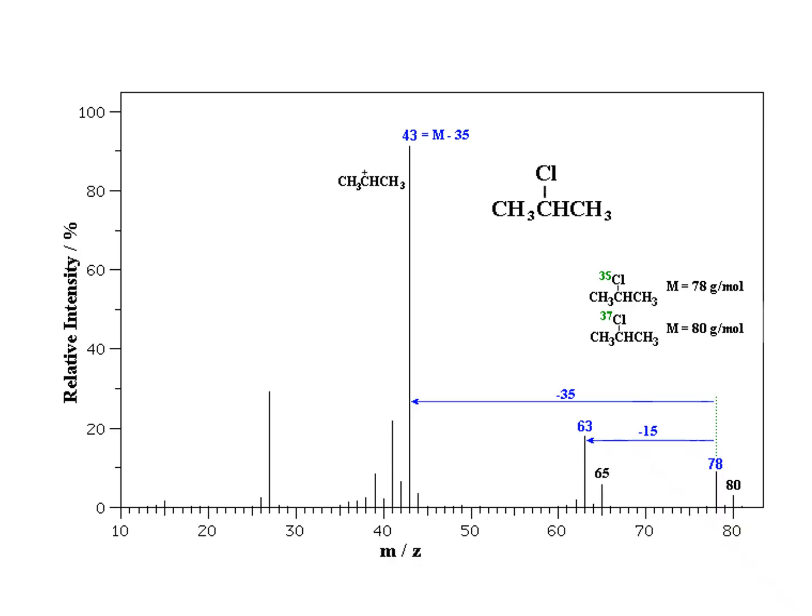If we look at this particular example, this again is another halogenoalkane, and we have chlorine 35 and chlorine 37. If we look at our molecular ion cluster on the right-hand side, we see that there's a 78 peak, a very small 79, an 80, and then an 81. So the 78 and the 80 again are the result of chlorine having a 35 and a 37. And we see the structure there with your chlorine 35, 37.